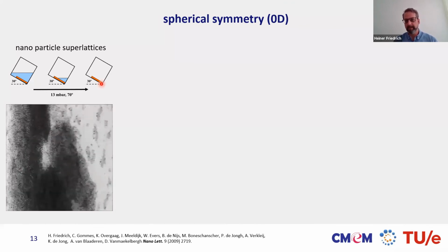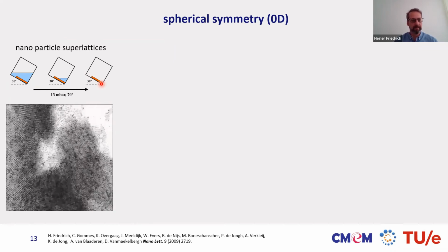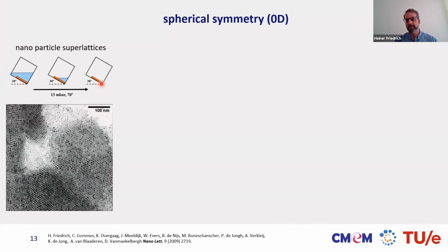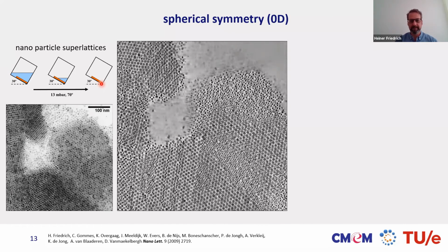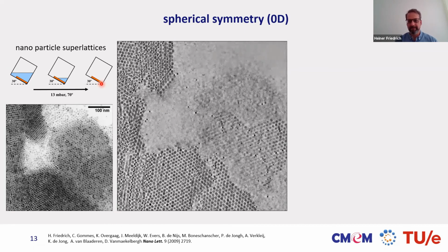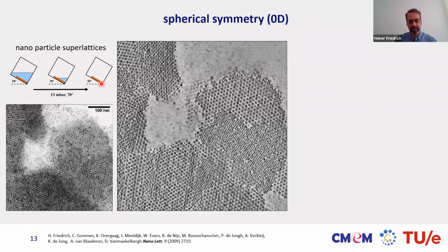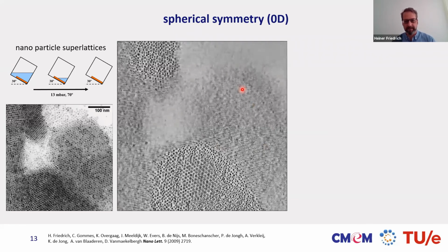Even though the projection requirement is not fulfilled for this type of material, you can see significant effects of crystals going in and out of diffraction conditions. Since this only happens for a few images of the entire tilt series, the quality of the reconstruction is not significantly hampered. So that still allows analysis of this rather large assembly, and just going through it slice by slice from the carbon film to the top and back provides a wealth of information about these truly beautiful assemblies. We can already see that there are different crystalline grains that occur during this assembly. One largest crystalline grain is shown here, and that has also been analyzed in somewhat more detail.